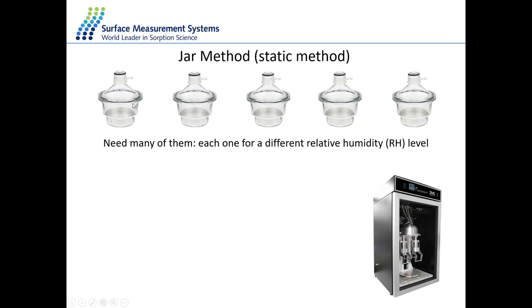inside the desiccator. So what you will do is record an initial mass of the sample, put the sample inside the desiccator, wait a couple of days, remove the sample, read the mass of the sample, put it back in. Repeat the process until the mass recorded by each desiccator basically is constant. In that way, the sample has reached equilibrium at each stage, and I can consider each dot, each part of the absorption as one of the desiccator conditions.